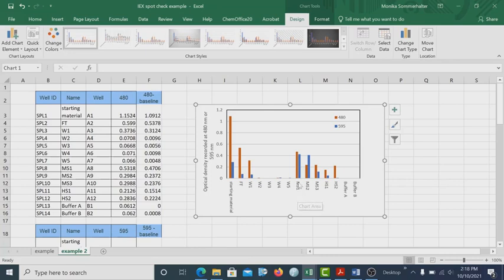As you switch to that medium salt buffer, however, with the help of the sodium plus and the chloride minus ions, the ionic interactions between the column material with the positive quaternary amine and the negatively charged amino acid residues on the surface of proteins were disturbed, so that with medium salt concentration, you were able to elute protein, that is based on the signal at 595 nanometer, and you were able to elute PPO, that is based on the signal at 480 nanometer for your PPO activity assay with dopamine as a substrate.